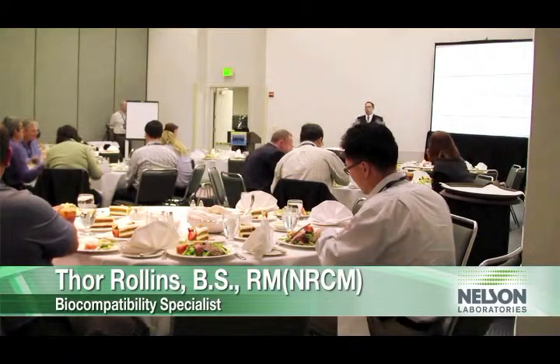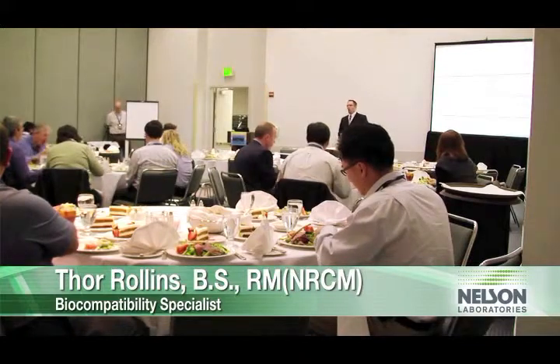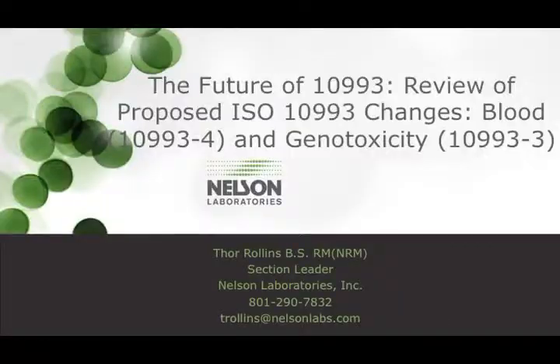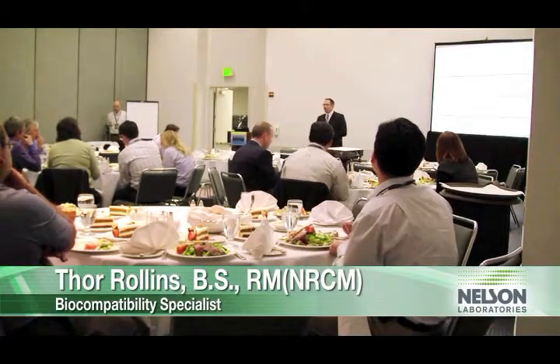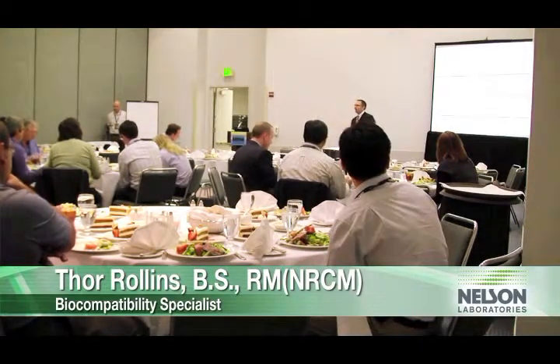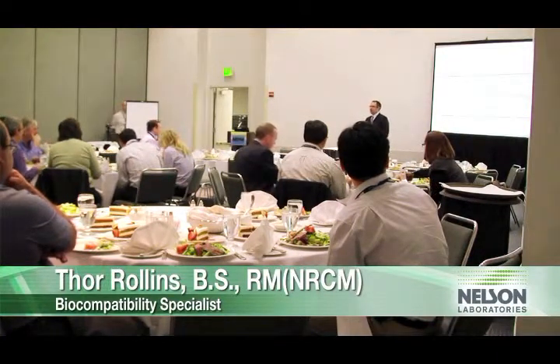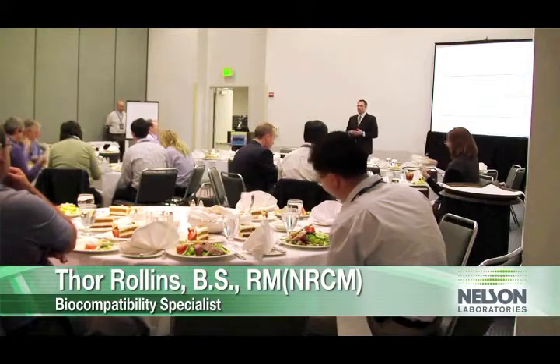The reason why we're here today is to go over a little bit on the changes that are happening with ISO 10993. Right now is a very dynamic and exciting and sometimes challenging biocompatibility landscape. If you've done biocompatibility recently, you might have submitted some things to regulatory agencies and might have gotten different feedback depending on the testing you did and some of the changes that we're seeing.